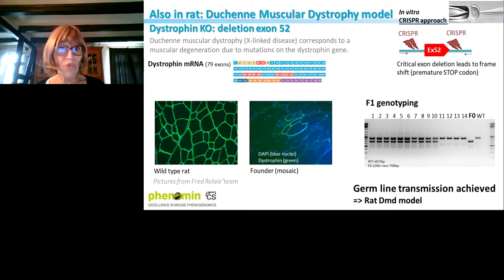But what I want to emphasize here also is that we can also generate knockouts in rats, and that works really well as in mouse, definitely, by injecting just 2 pairs of guide RNA with Cas9 into an egg and targeting a critical exon. This critical exon deletion will generate a frame shift. We can generate knockouts. And these slides are really nice. I really like to show them, because you can see here, it's our collaborators that gave me this slide. You can see the dystrophin that is really nicely expressed in wild type, whereas in founders, you can see that the animals that are obtained in the first instance are mosaics, and only some cells are expressing dystrophin. Then it's a really nice way to see it.